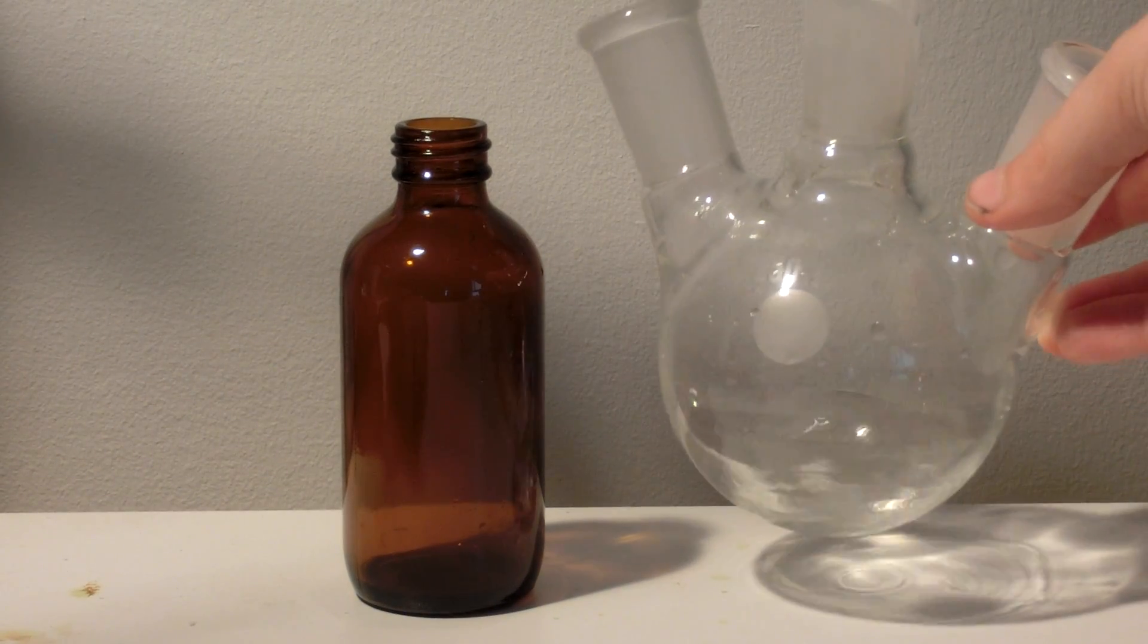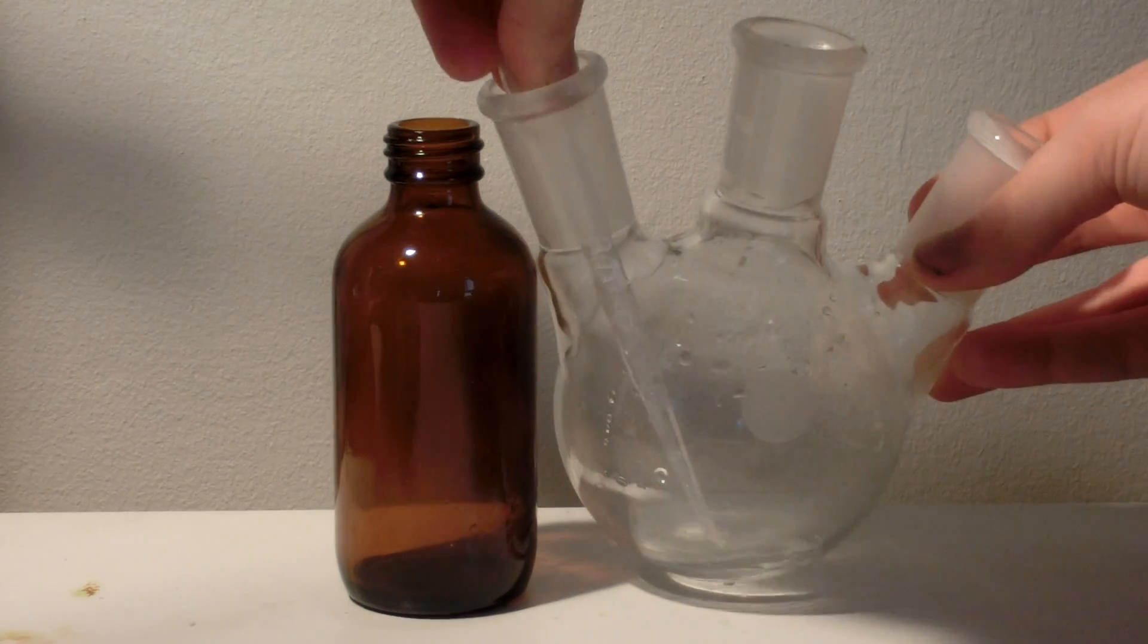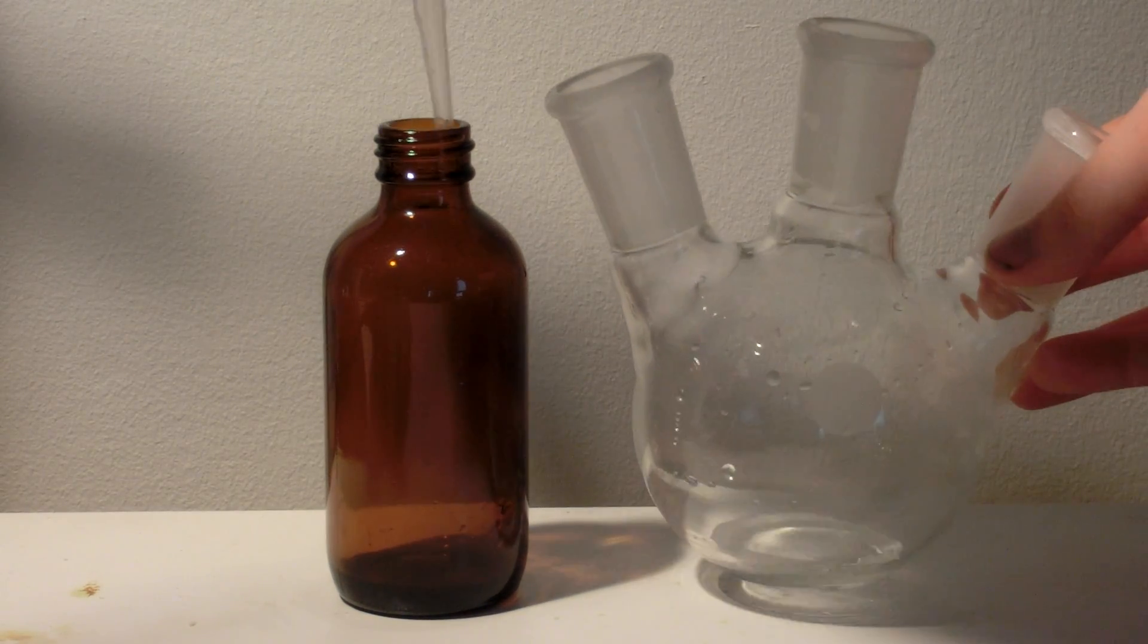This is our final yield of formic acid. It should be added to an airtight amber glass bottle for storage.